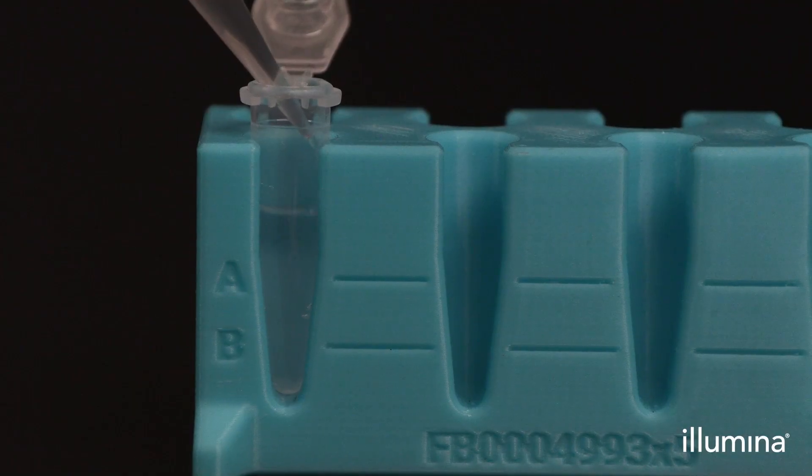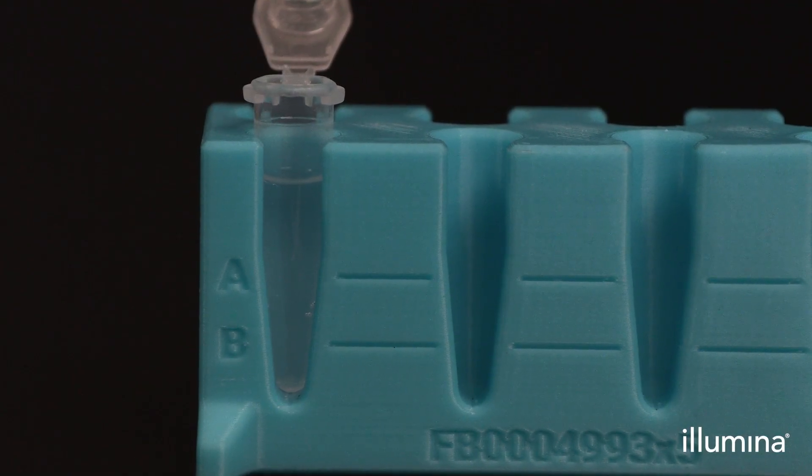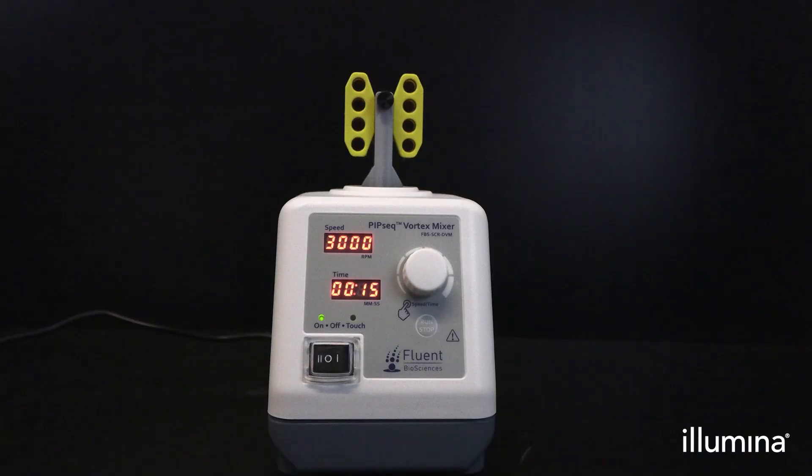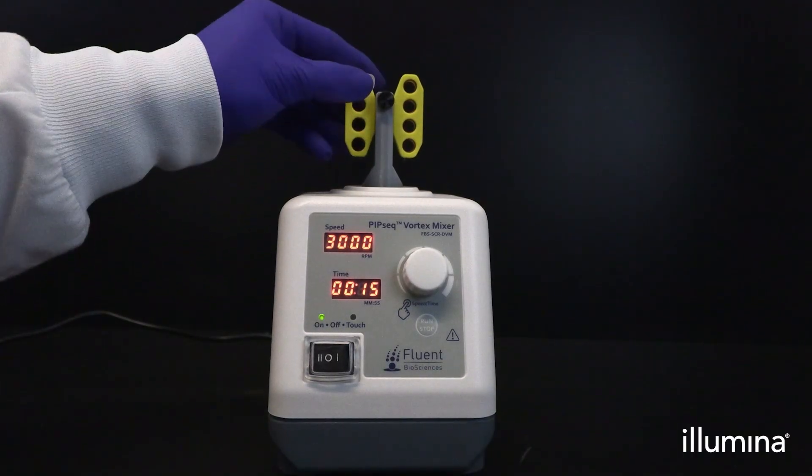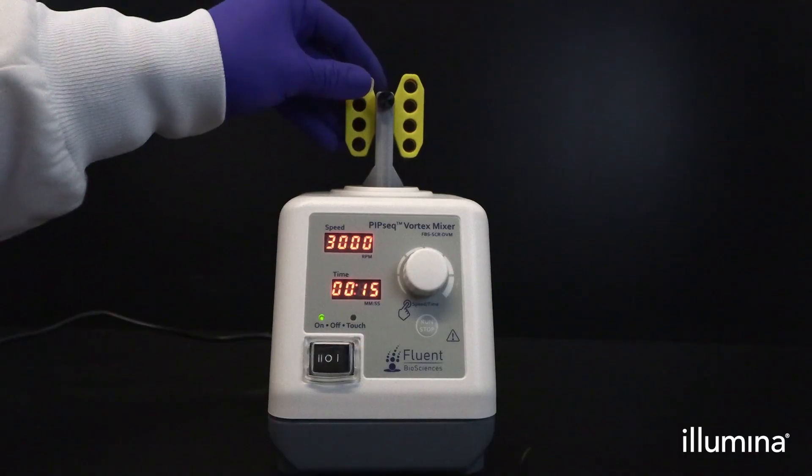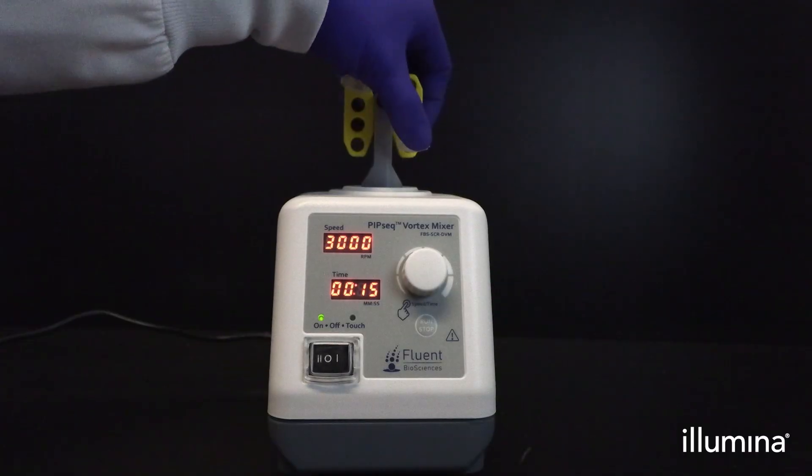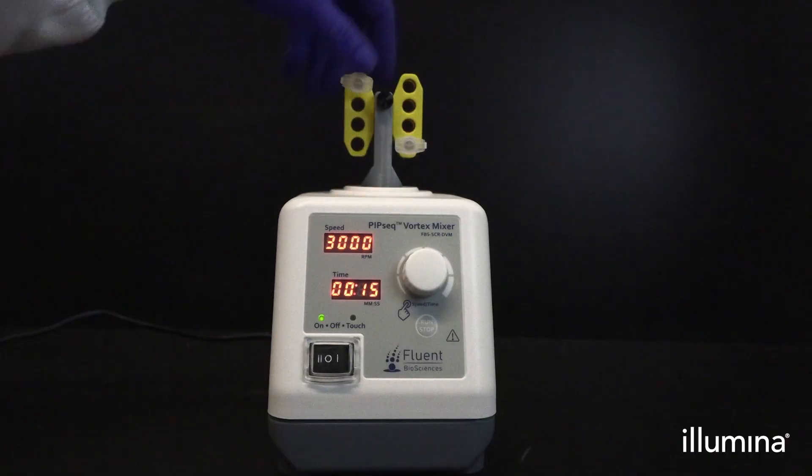Next, add 320 microliters of partitioning reagent down the side wall of the pip tube. Tightly cap tubes and place in the rotating vortex adapter in the horizontal configuration. Ensure the tubes are fully inserted into the adapter.